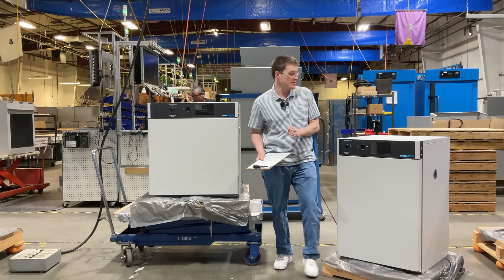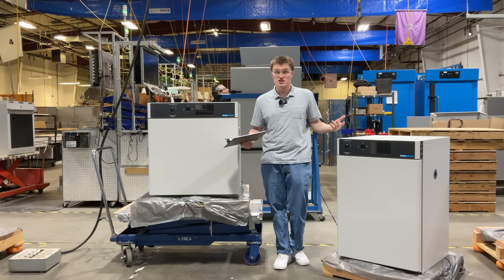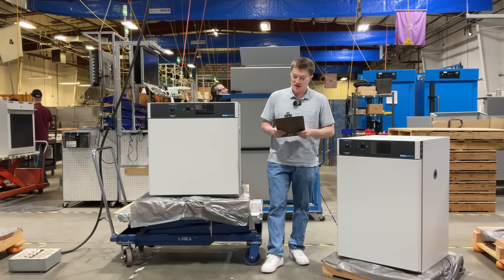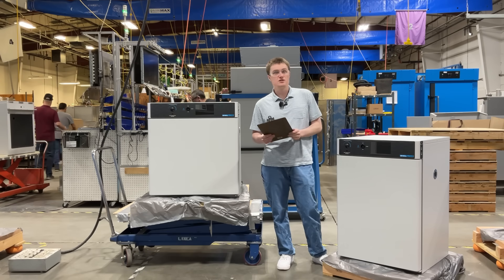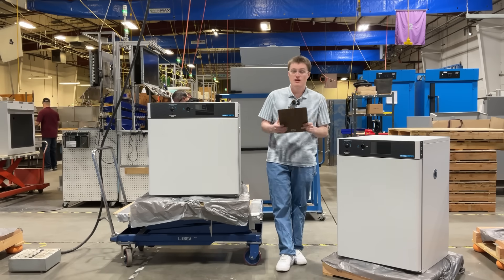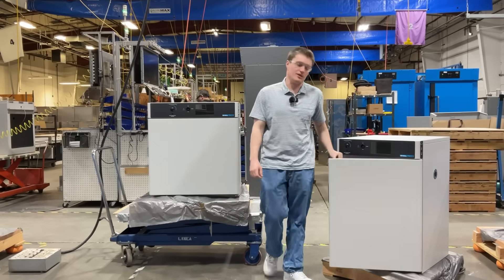These products feature precise temperature control, spacious interior and adjustable shelving, and a user-friendly digital control panel interface. These features, among others, make these products a trusted solution for microbiology, research, pharmaceutical applications, and the consumer electronics field. Let's take a look inside the units.